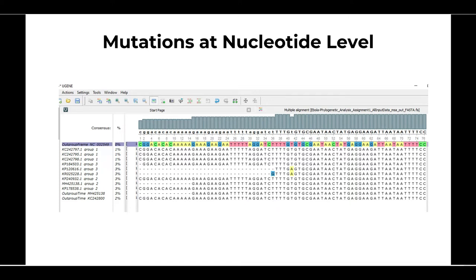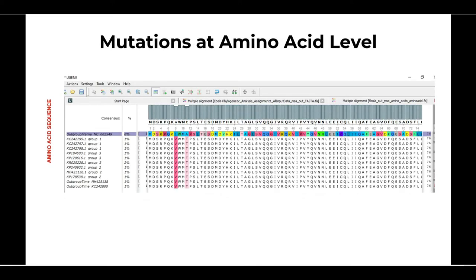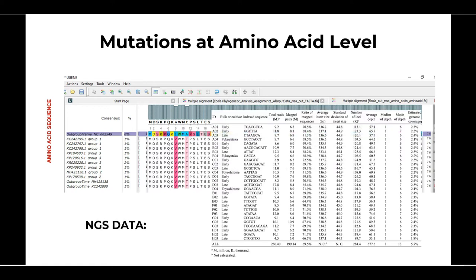In the OmicsLogic Learn lesson on mutability, we discussed mutation, SNPs and mutability. Now let's learn how we can use this information to analyze NGS data from different sources, locations, and years to derive biological meaning regarding the data.